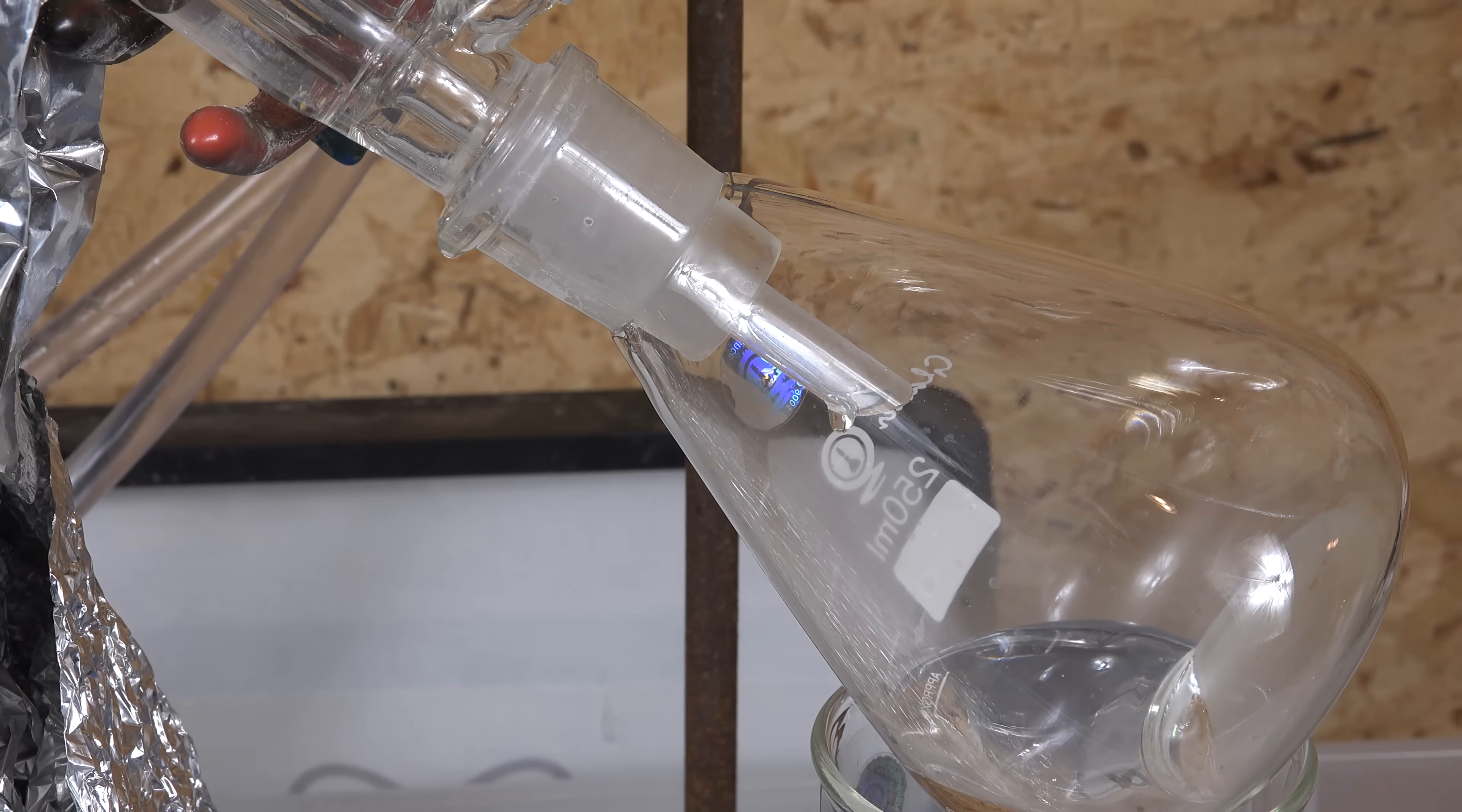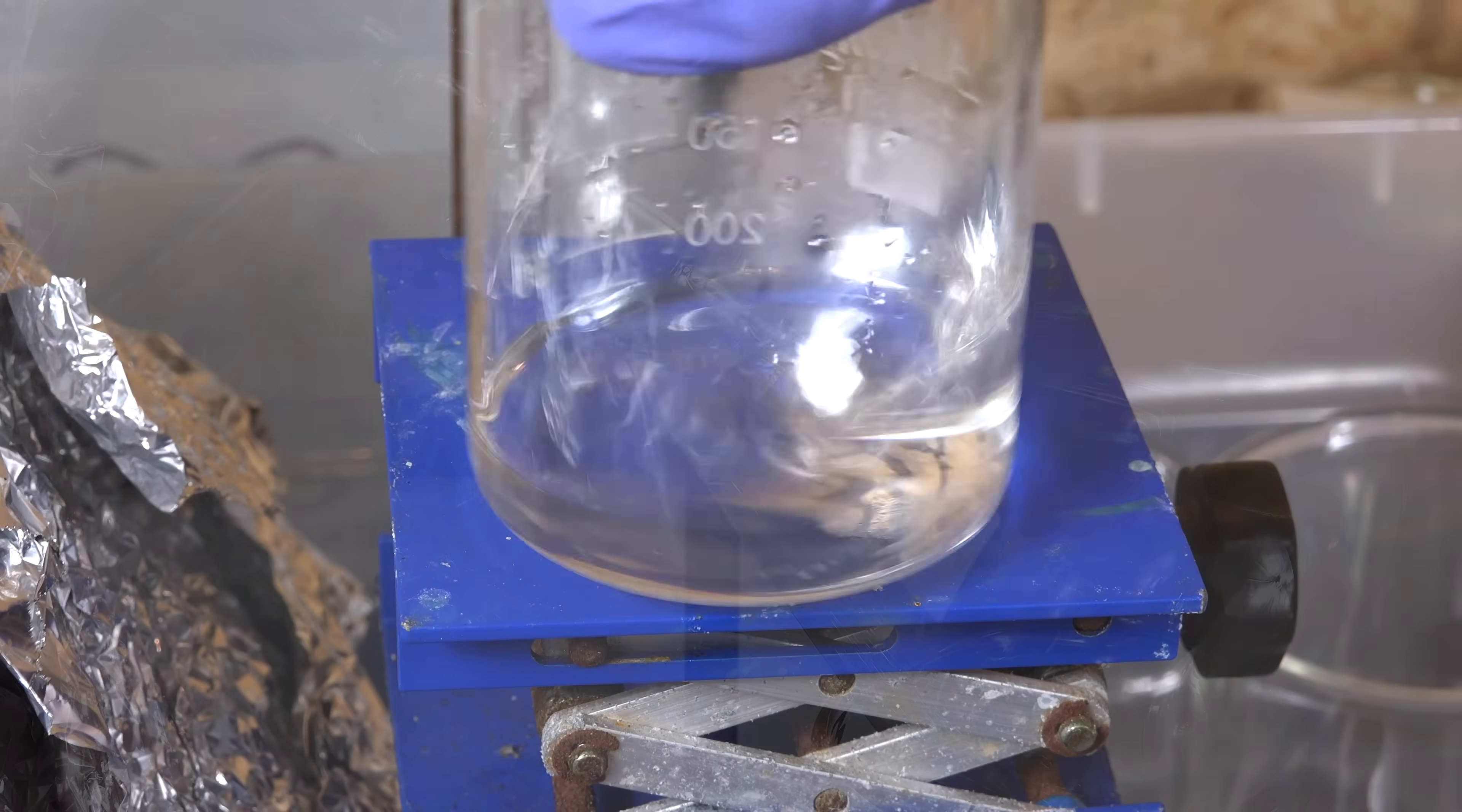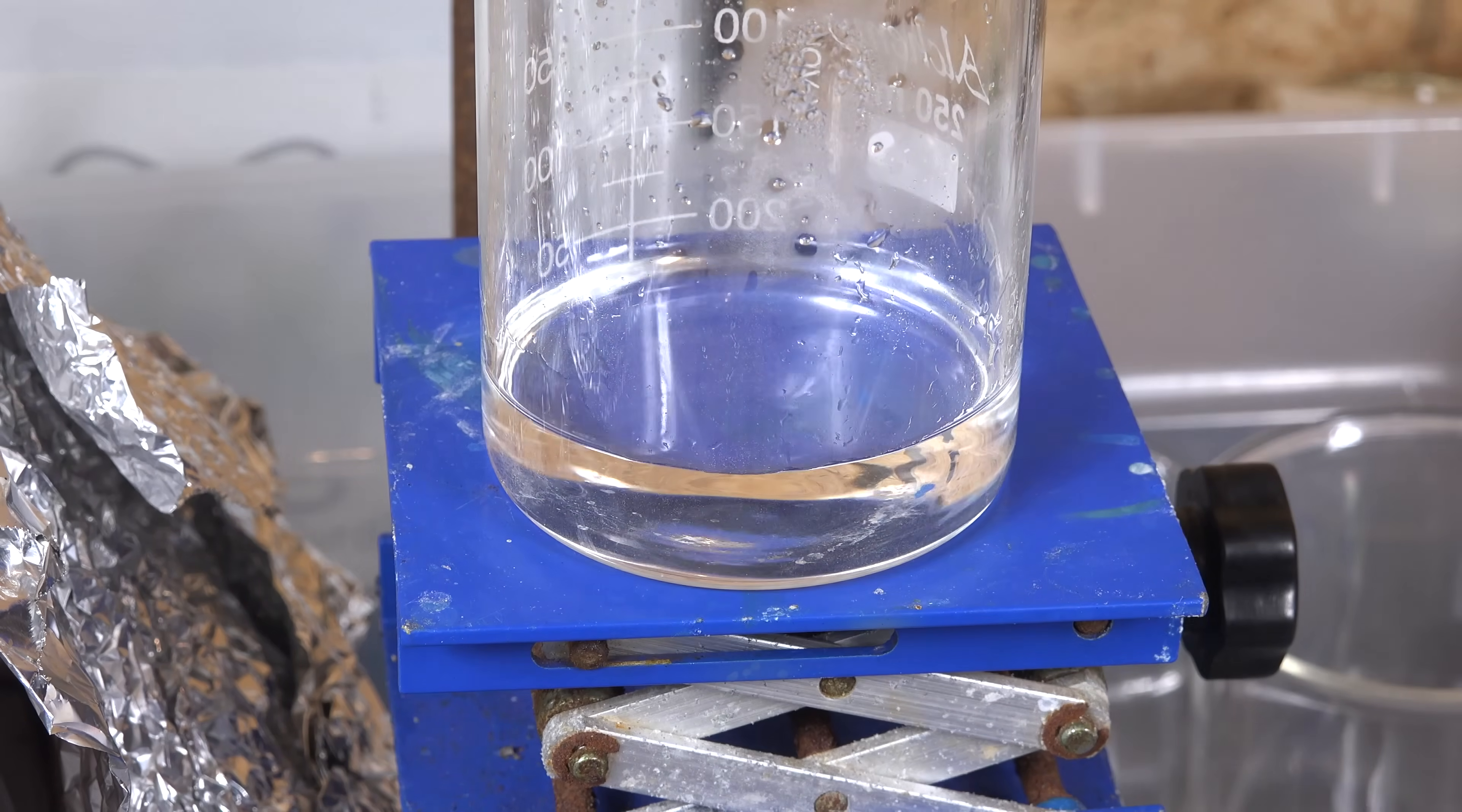I kept checking the density of the distillate as it came off and when the density was above that of water, I start collecting the sulfuric acid. And there it is, about 70g of diluted sulfuric acid.